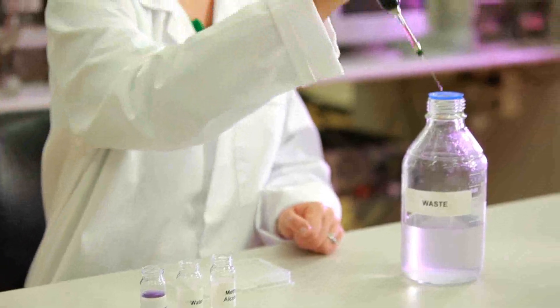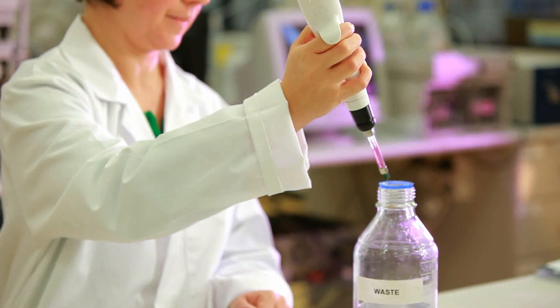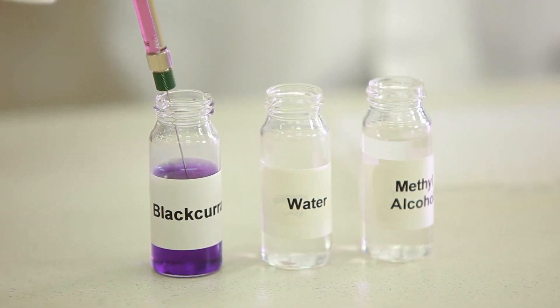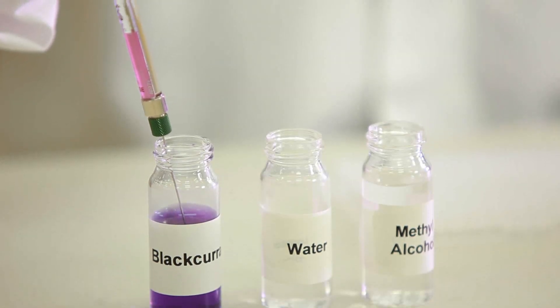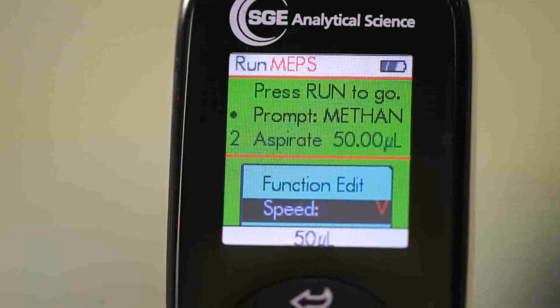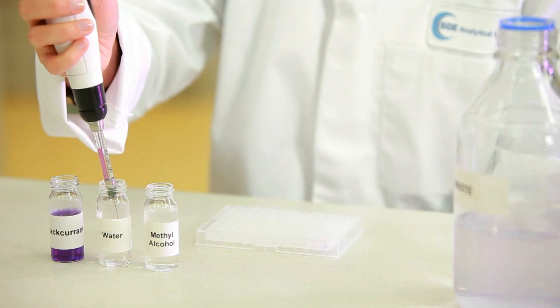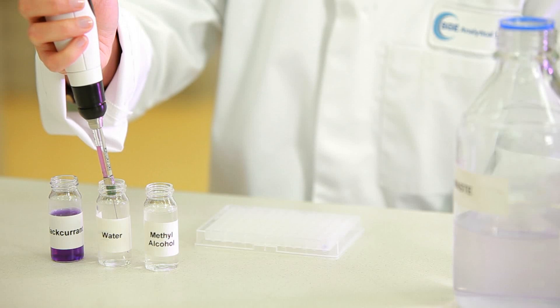This process conditions the SPE stationary phase, and now the sample can be loaded. The black current juice sample is aspirated at a predetermined flow rate and cycle number. EVOL is ideal for SPE method development since it is a flow rate dependent process.